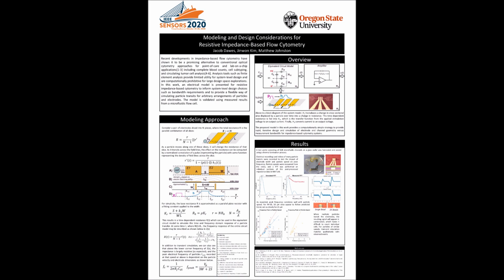So typically, if you're designing a system like this, you may use something like finite element analysis to model the electrical or fluid components, or you may use just an equivalent circuit model. But what we were interested in doing is coming up with a computationally simple method of modeling and simulating these systems, while including things like channel geometry, electrode geometry, as well as purely electrical requirements such as bandwidth.